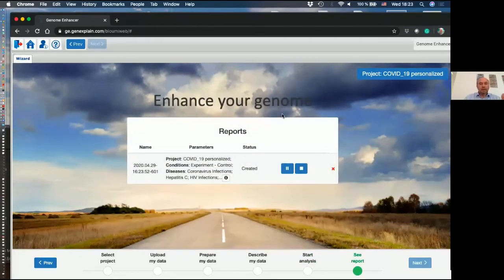And the analysis is started and prepared for creation. Then it will take around 4 or 5 hours until all the data is analyzed, the FASTQ files are aligned and pre-processed, and then differentially expressed genes will be found, then steps like detection of master regulators will be performed, and then detection of drugs will be done. So all this takes time, of course. So we will not wait now for 4 hours.